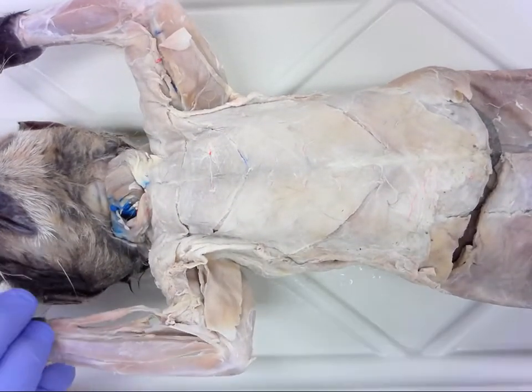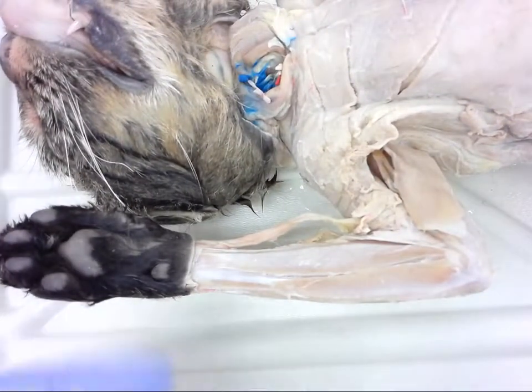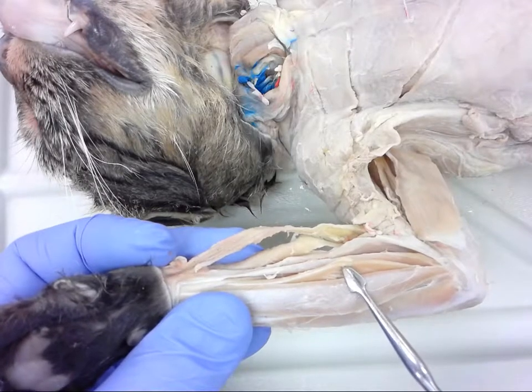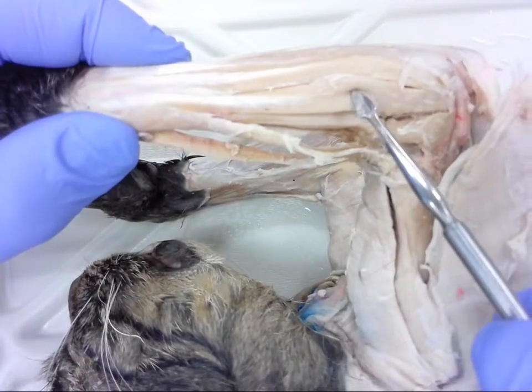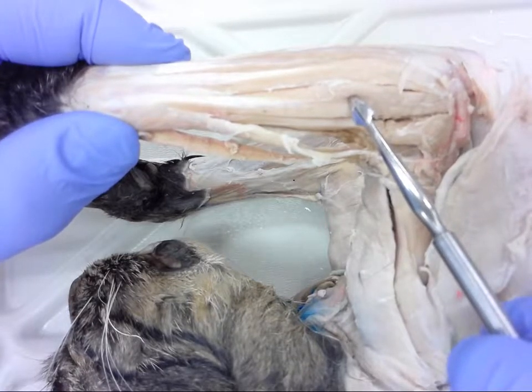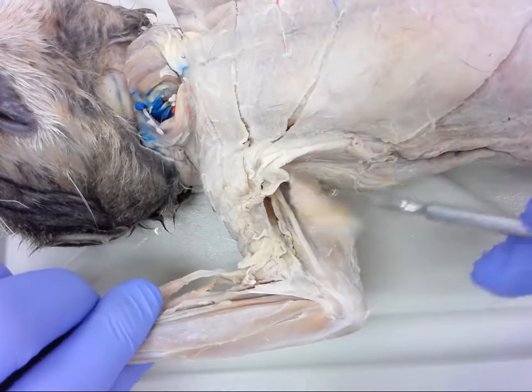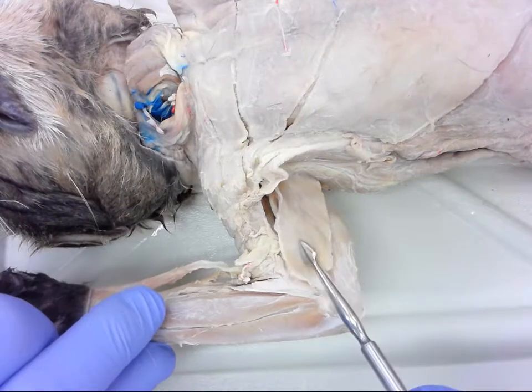Number four, we'll move to the forelimb. I'll zoom in just a little bit so you can get a better view of this forelimb. Number four is right here. Number five, I'm going to flip over to get a better view — that's number five. Number six, back to the upper forelimb — this muscle here has been reflected. Number six.